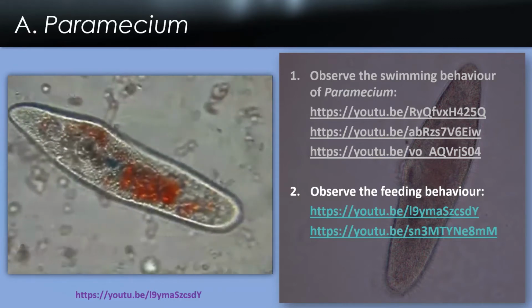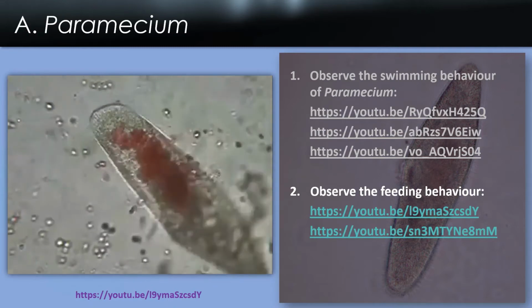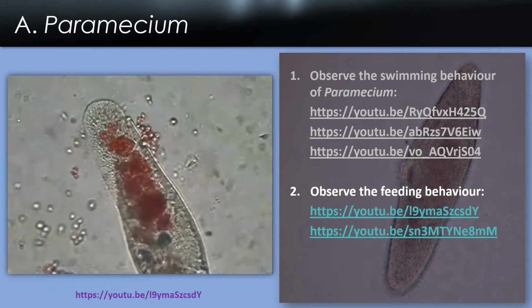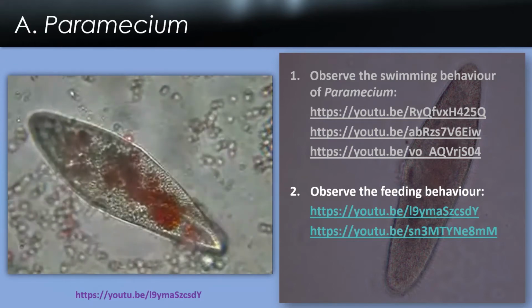Take a look at those two videos there. The first one is a little bit more like what we would observe in Biology 107. The second one is a lot more professionally done, and it's a really stunning video to look at.